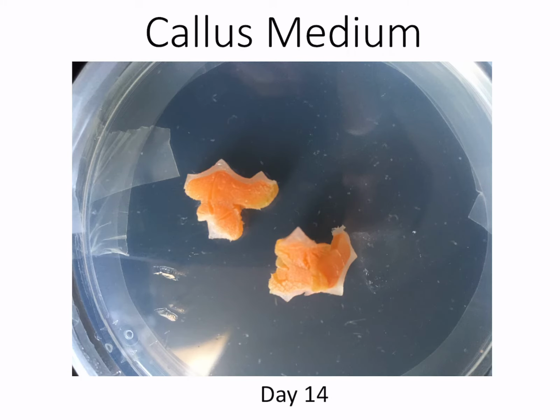And if we look up close, we see that they're continuing to swell and change shape. And we also see what could be the beginnings of friable callus tissue. Now, friable just means that it isn't attached. It comes apart easily and can be pulled off of the rest of the tissue. So it's easily detached. And that's what callus is.